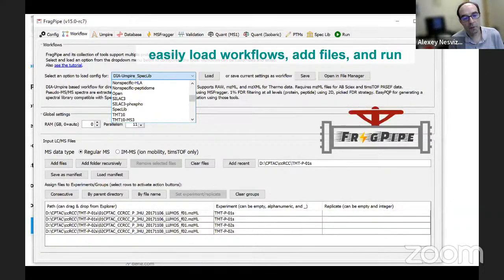Of course, you can customize workflows, you can save a workflow as your custom workflow, even share it by email with someone. People often contact me and I customize the workflows and email back and do things like this. So that's why it's very powerful.